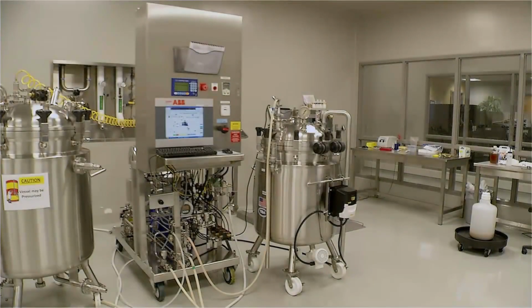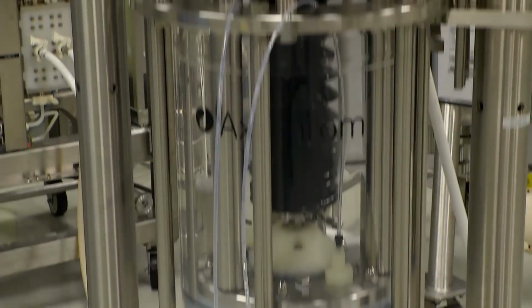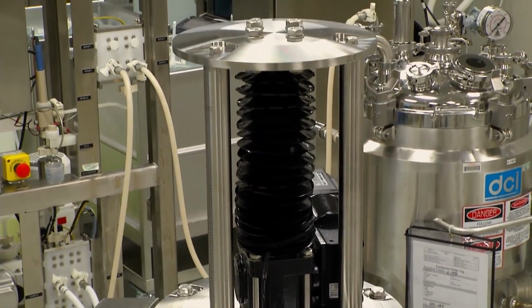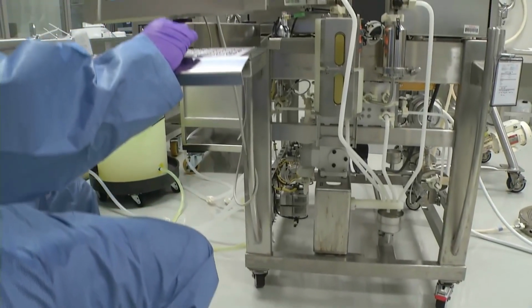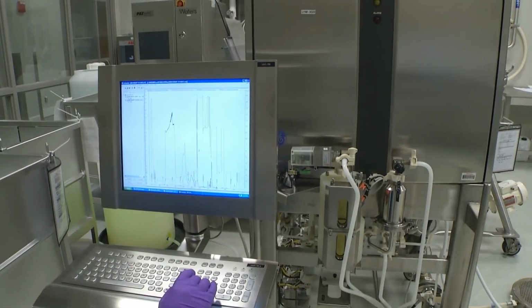The recovery process is finished. The clarified lysate is pumped into a vented, temperature-controlled transfer vessel. This lysate tank then moves downstream to the next series of process steps, purification, where dissolved impurities are removed from the GFP solution and GFP is subsequently concentrated and stabilized.